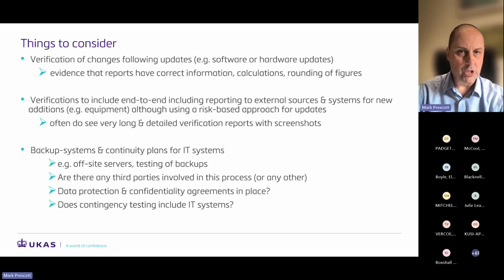You know, that whatever tests a GP requests, that you are getting that request correctly. It might only be your own LIMS system that's changed. The actual end user system may be completely unchanged, and they might have been in place for many years, and so you think, actually, they've not changed, so therefore it's okay. But it may well be that some updates to your system may affect another system down the line. But definitely for a new LIMS system, we will certainly need to see full end-to-end testing.